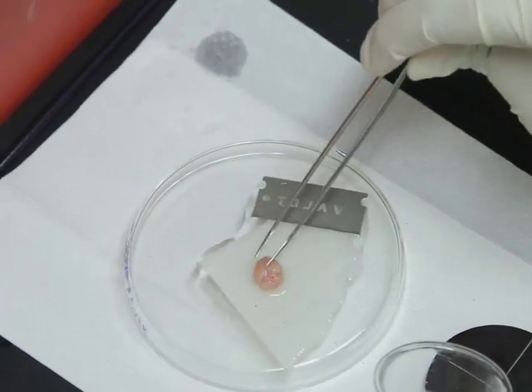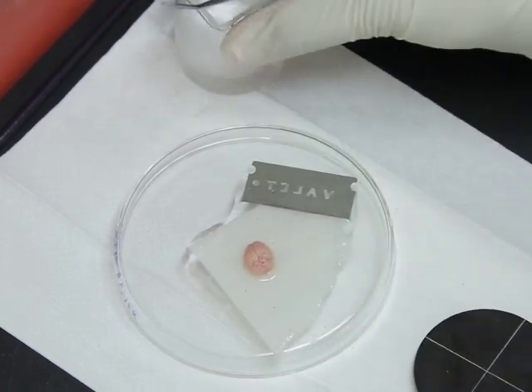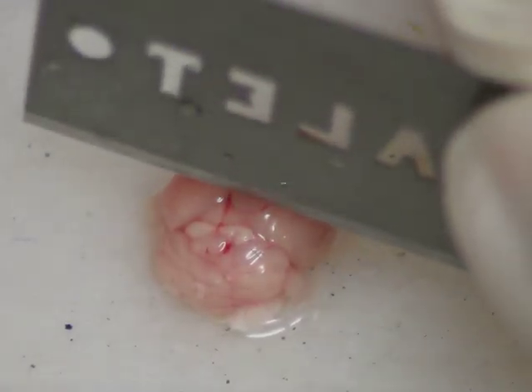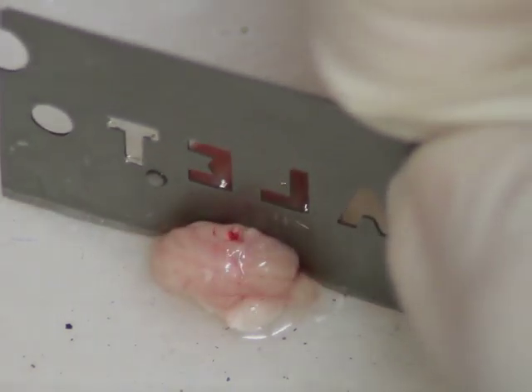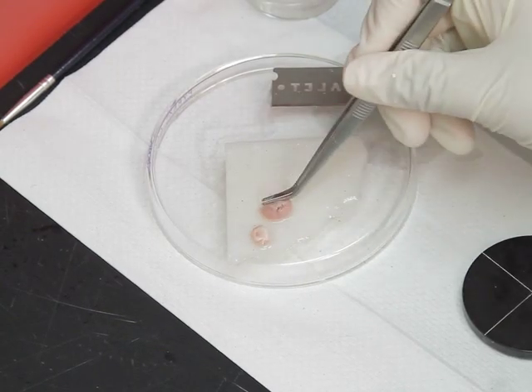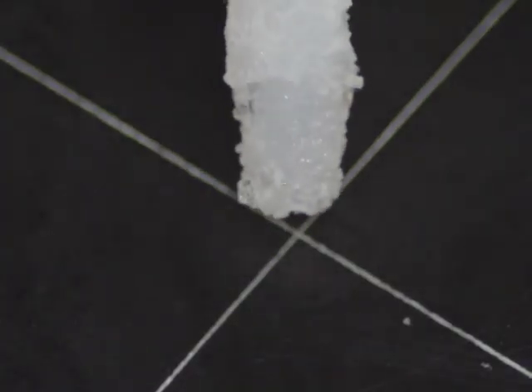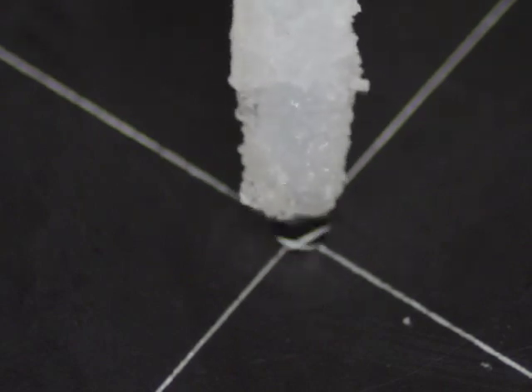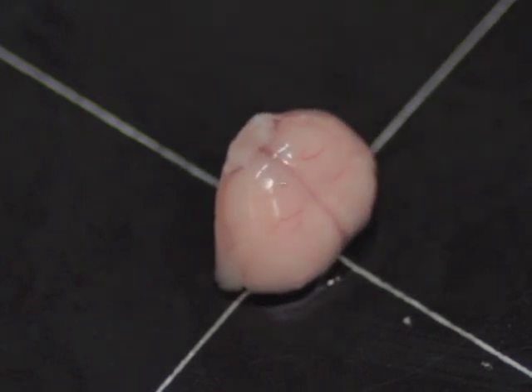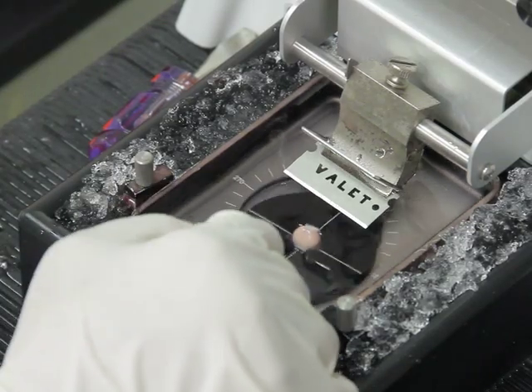Transfer the freshly dissected mouse brain onto it with a pair of forceps, then remove the cerebellum by cutting along the medial-lateral axis with a razor blade. This creates a flat base that can be affixed to the vibratome stage. Next, add a drop of the loctite adhesive on the specimen stage, affix the flat end of the prepared brain on the stage immediately, and keep it as upright as possible. Then place the stage in the specimen chamber and tighten the screw.